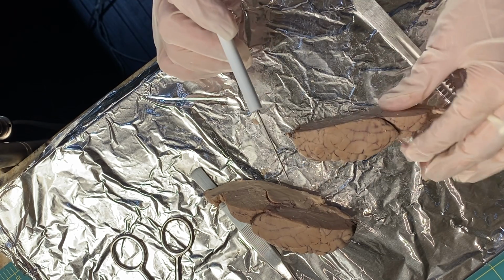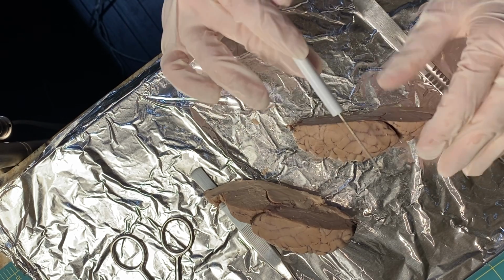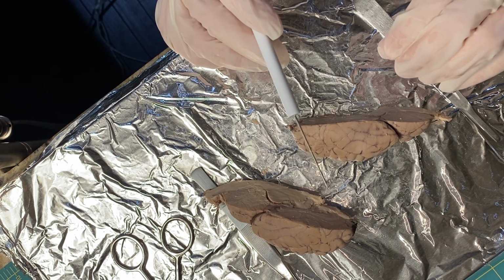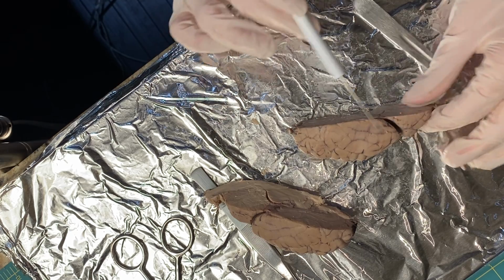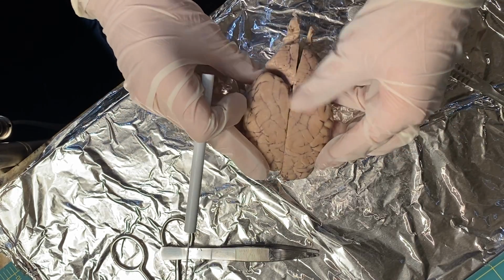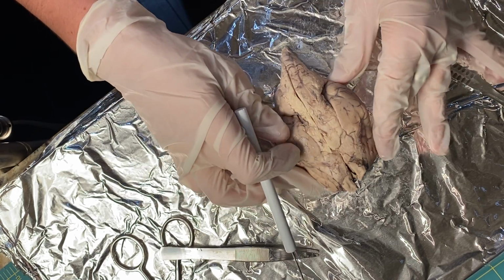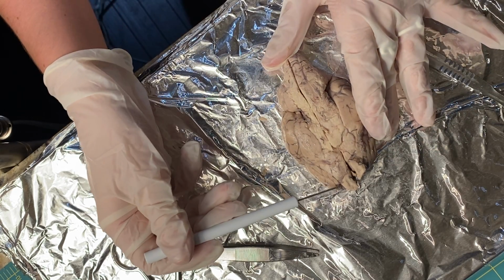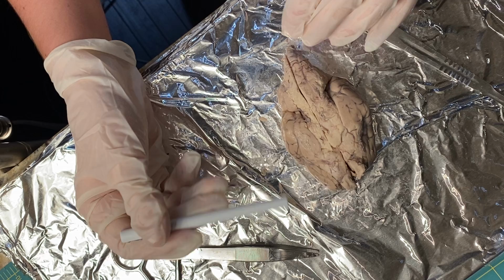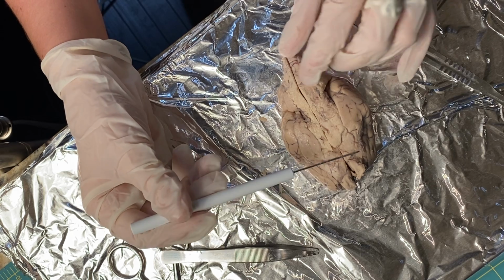Now for gray matter, gray matter are areas of the brain and the spinal cord containing cell bodies, dendrites, and axons. They are found in the cerebral cortex and the inner portion of the spinal cord. Now if we turn it around, we can see the olfactory bulbs. So the olfactory bulbs transmit smell information from the nose to the brain, the bulbs.